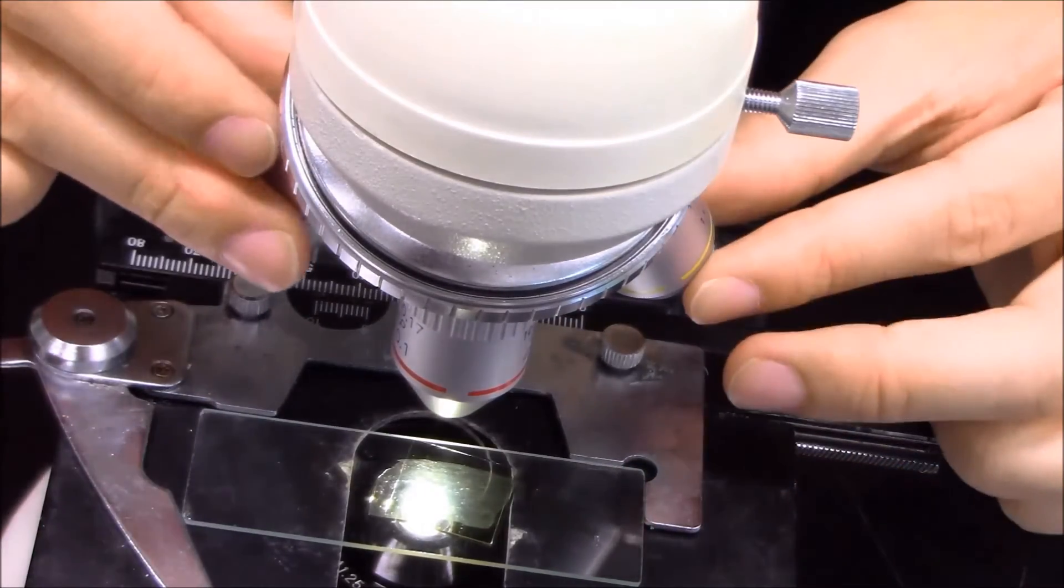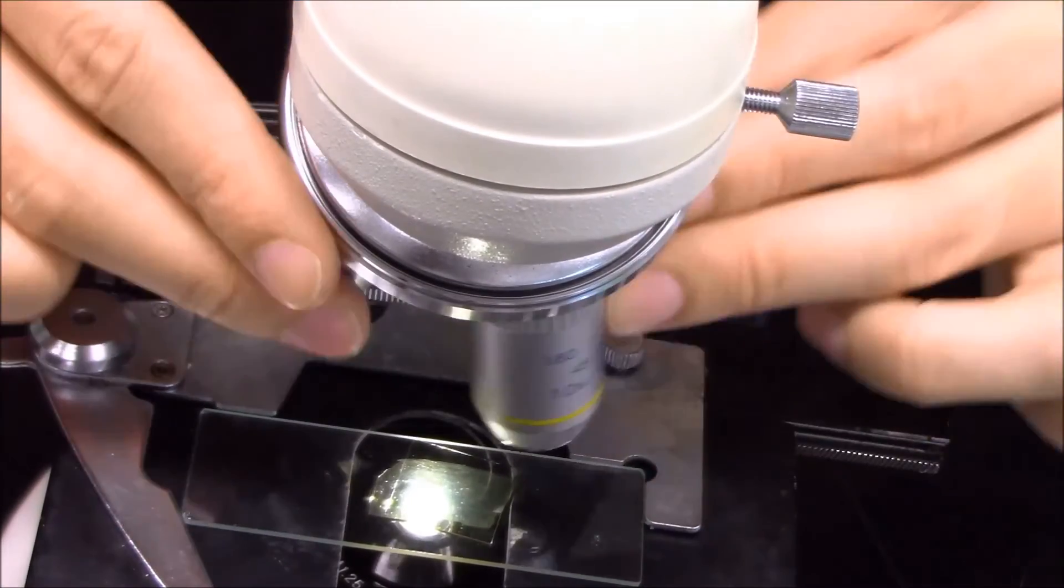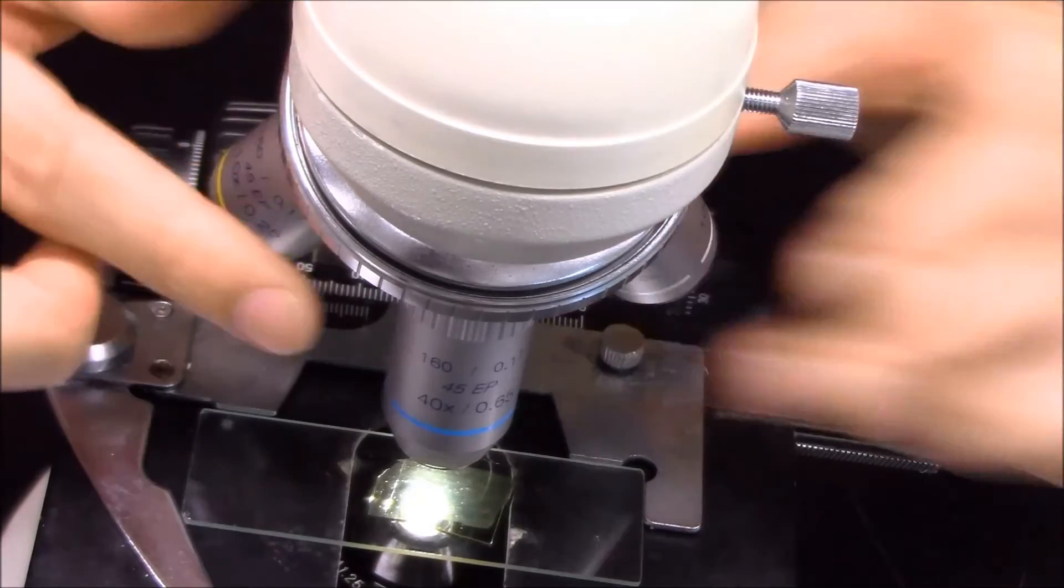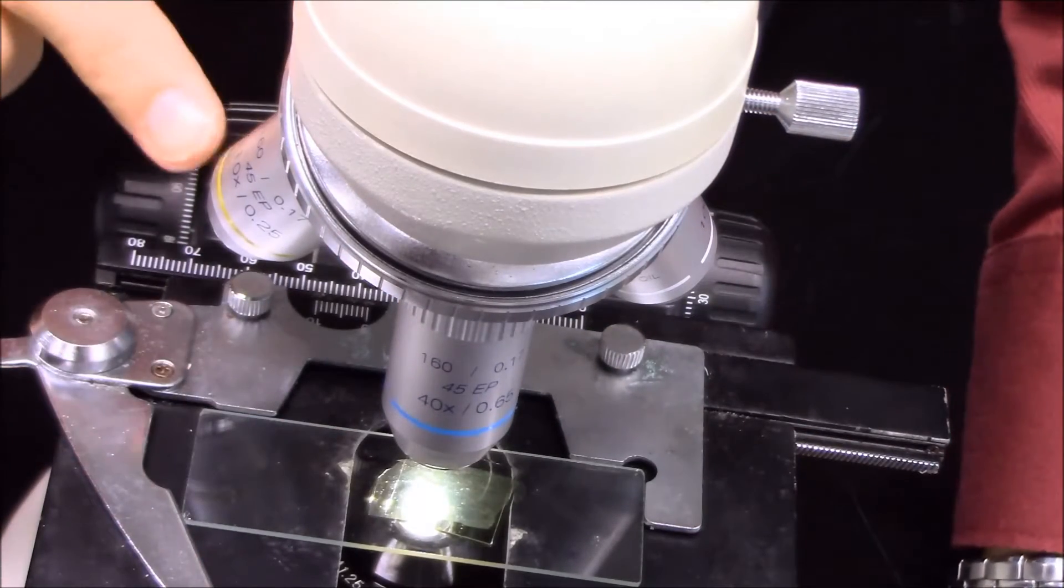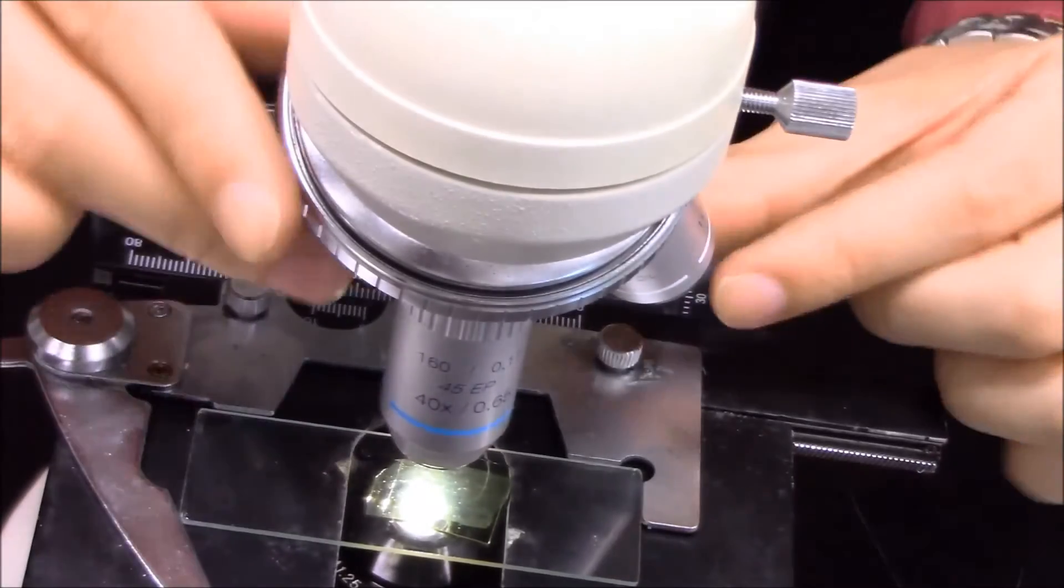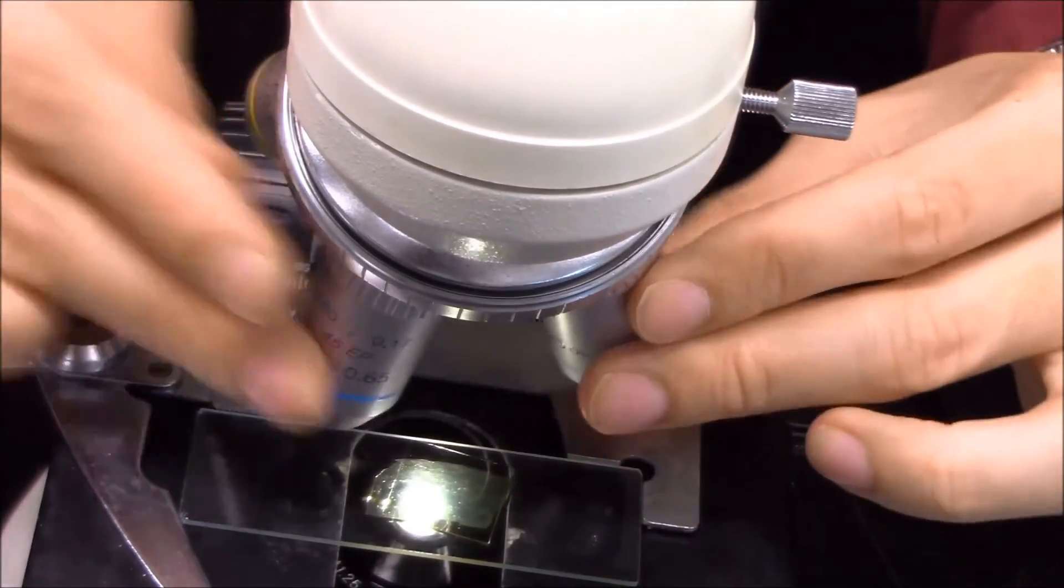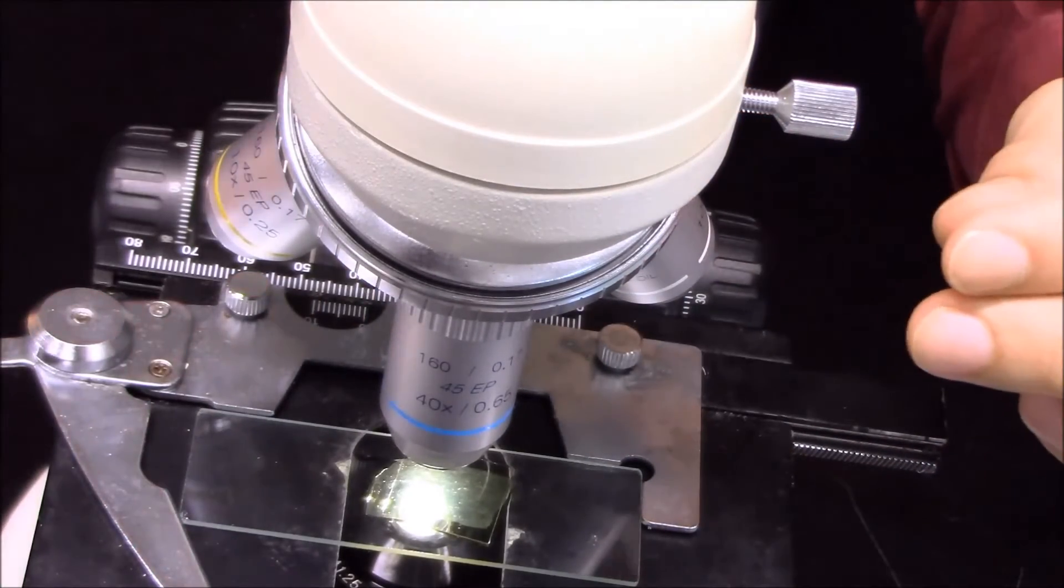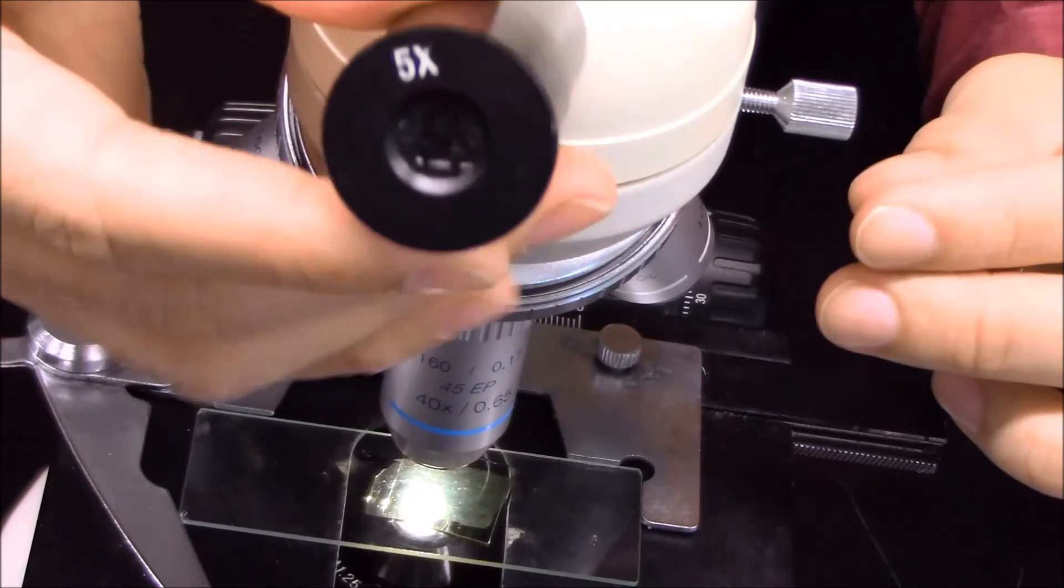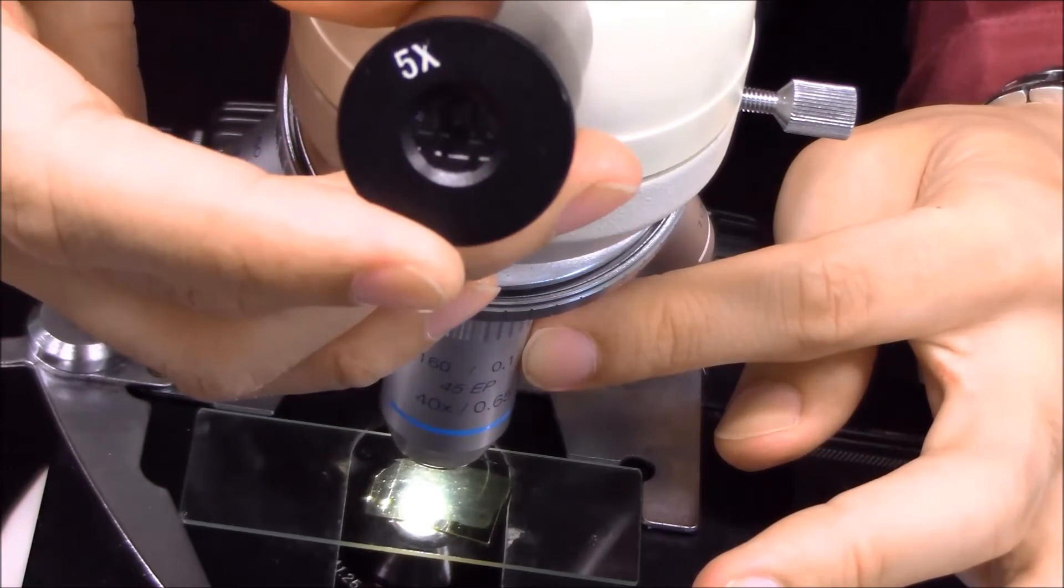And then you can change to 40x, the blue one. Not the 10x yellow one, and also not the silver one. The silver one is 100x. What we use is the blue one, 40x. So the total magnification scale will be 5 times 40, so that would be 200x.